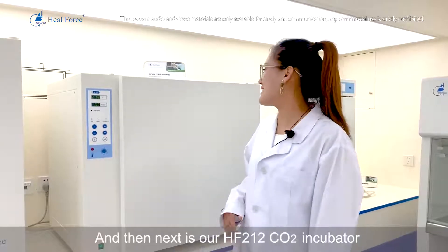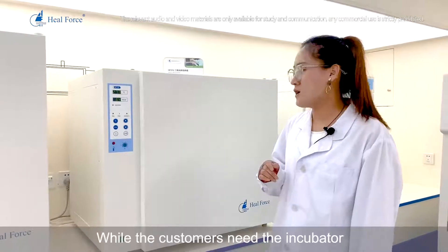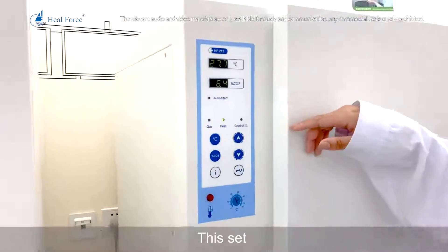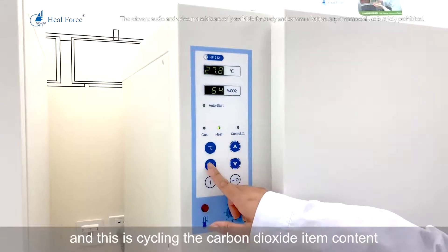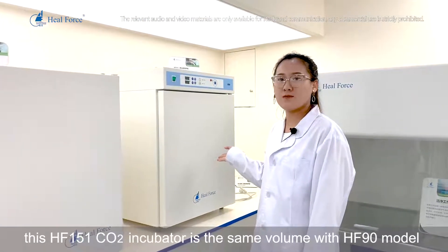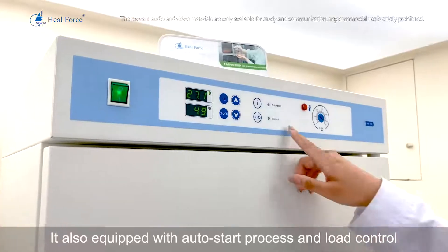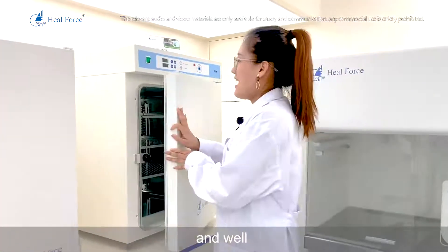Next is our HF212 carbon dioxide incubator with a volume of 212 liters — recommended for customers needing around 200-liter capacity. This model is equipped with an ultraviolet ray light. The control panel allows you to set the auto-start process, temperature, and carbon dioxide content. Finally, the HF151 carbon dioxide incubator shares the same 151-liter volume as the HF90 model. It also features an auto-start process and load control, with a similar structure to the HF90.